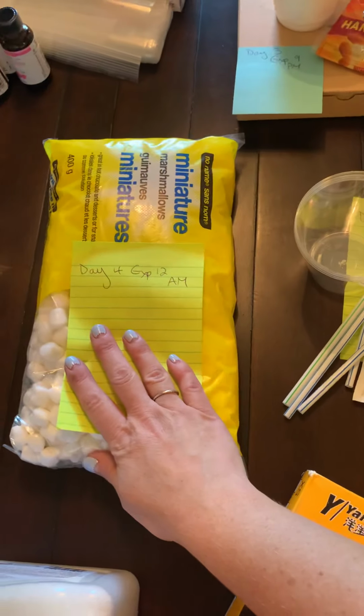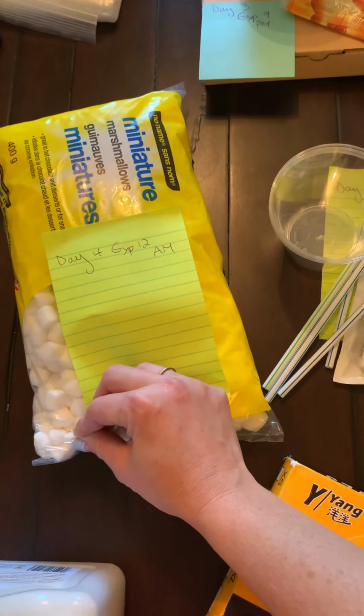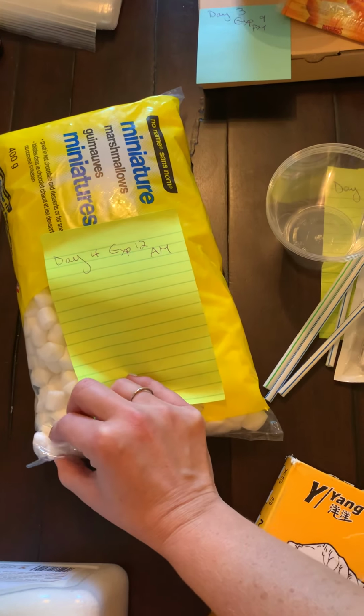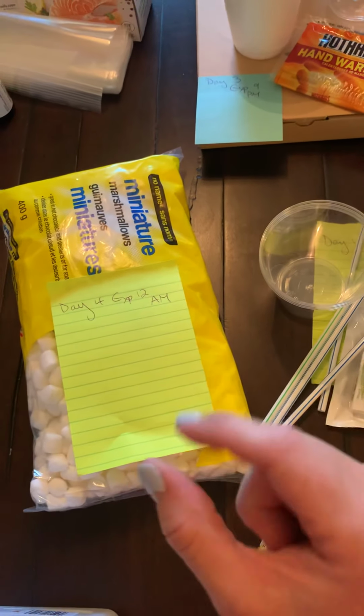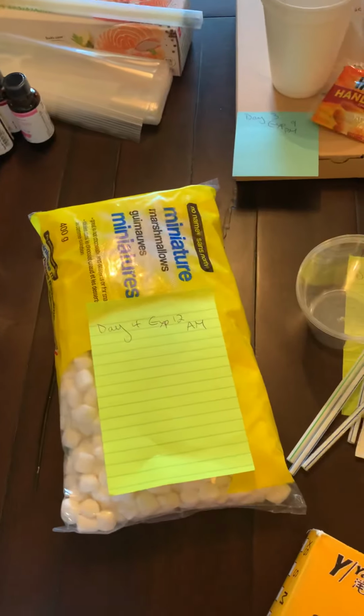This one, we're gonna do some gas laws tests with some mini marshmallows, and I'm just waiting on some syringes. Because there's lots of air in these guys, if you put them in a plastic syringe and you stretch it and contract it, they should get different sizes, and they're marshmallows, so you know they're fun.